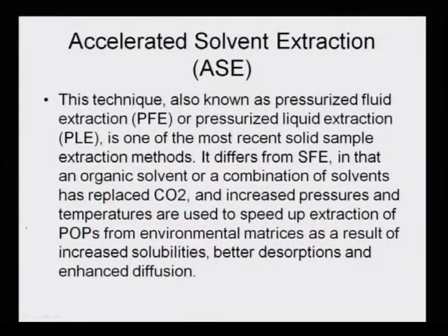The next method is accelerated solvent extraction, ASE. This technique, also known as pressurized fluid extraction, PFE, or pressurized liquid extraction, PLE, is one of the most recent solid sample extraction methods.